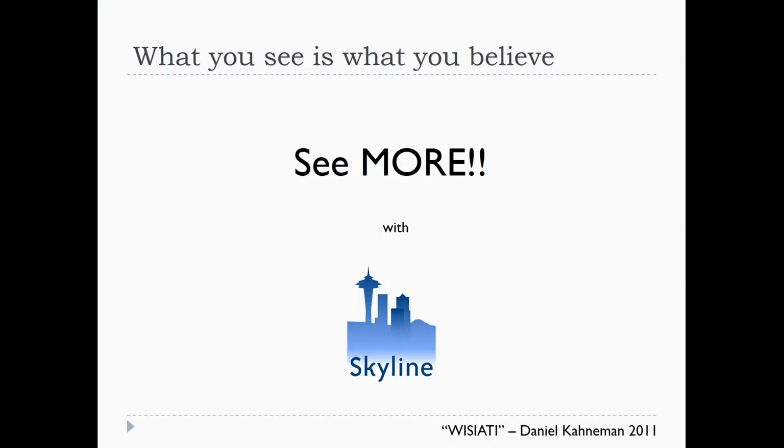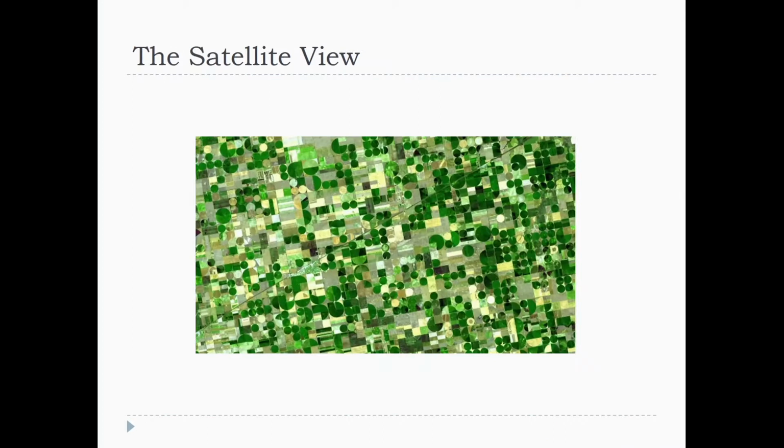Oh, that plot is really useful, let me integrate that into Skyline. If you look at the Skyline implementation of mProphet, we took all the plots that they put in the paper and said, let's just make those available to everybody, and we make them interactive. So that's what we do.